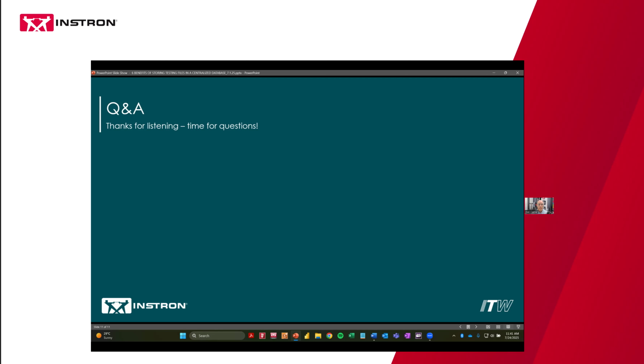It's a good question. And I think it's pointing at where a lot of software is headed, or if not already there. Simply put, Universal today doesn't currently have an automated AI tool which knows what a reference curve or characterization curve is to then automatically flag any subsequent curve that says this looks different, you should take a look at it. It's something that we have actually heard a request for in the past, and it is on our backlog to have in the product in the future, but it's not there today.